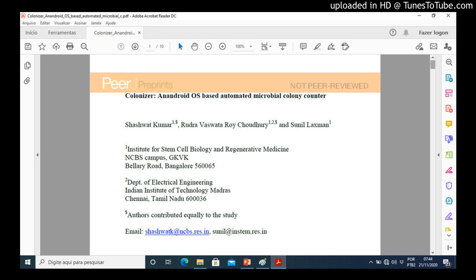Otsu's thresholding. Otsu's thresholding is a binarization algorithm used in image processing. It involves iterating through all possible threshold values and classifying each pixel as either background or foreground depending on whether it is larger than the threshold.